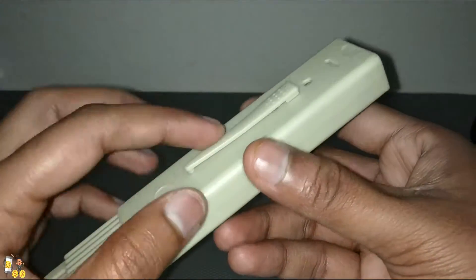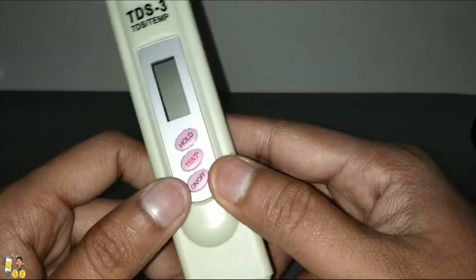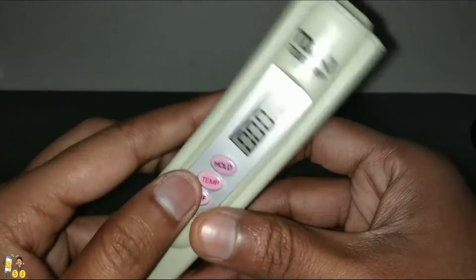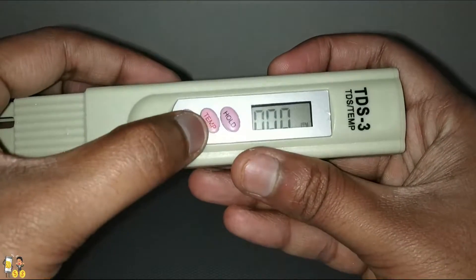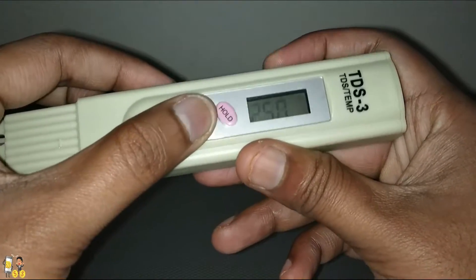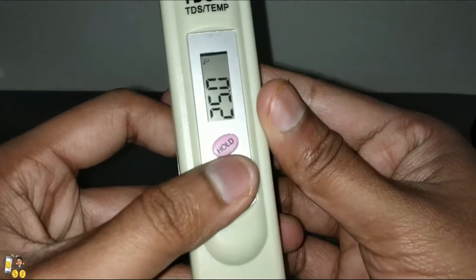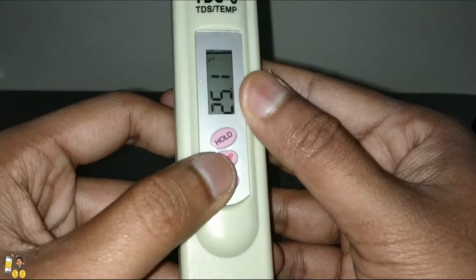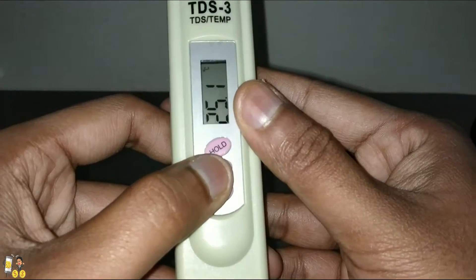You can also hold it like a pen. Let's turn it on. We have turned it on, and here the temperature mode is available. When you tap on temp, it shows the current temperature, which is 25 degrees centigrade.